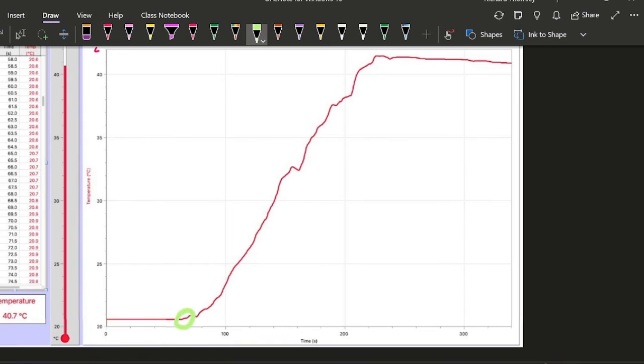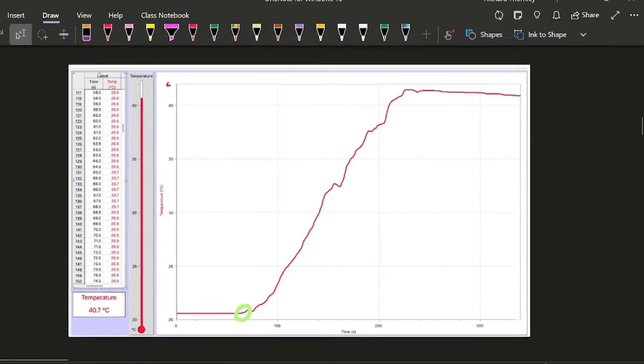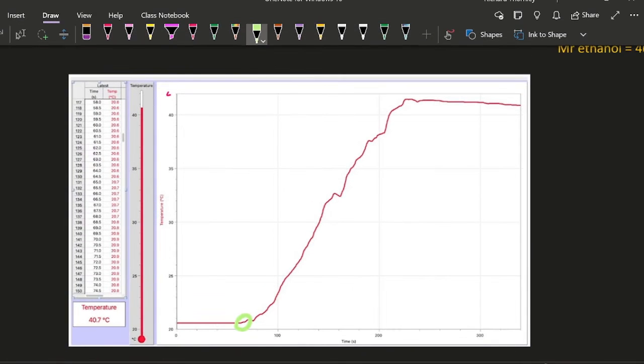But what's the final temperature? Well, it's normally multiple choice as well, so they give you 4 opportunities to mess this up. First of all, I stopped my experiment here. So is that the final temperature? No, because it carried on heating up. There was thermal lag. Even though I shut off the experiment, it kept heating up. So what about this temperature? Is that the final temperature? No, it ain't. But surely that's the hottest temperature. Isn't that the final? No, no, no, no, no.